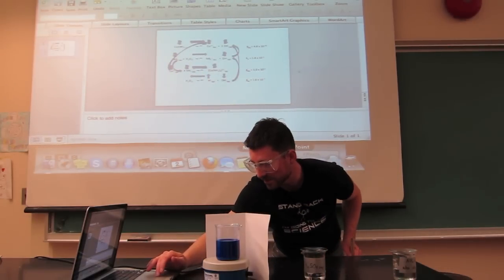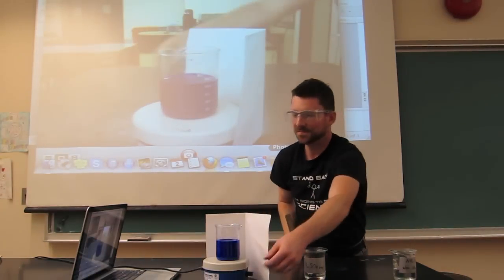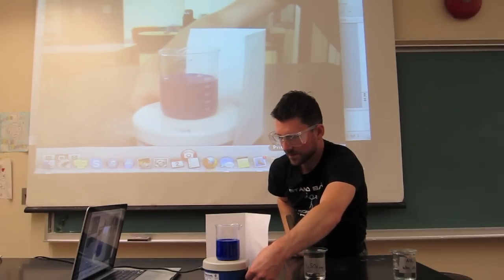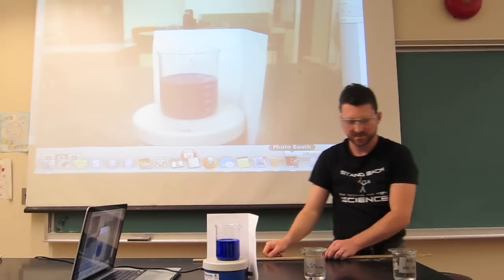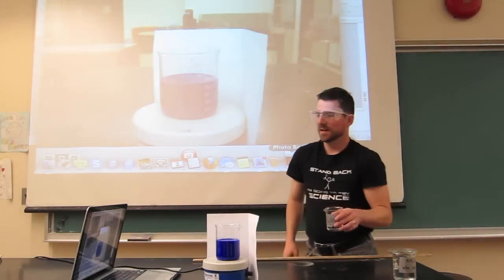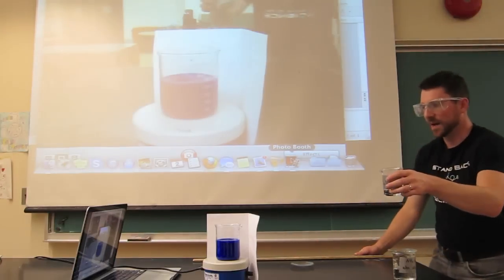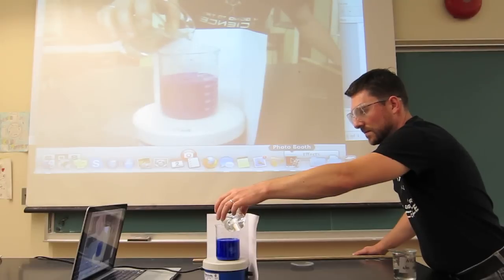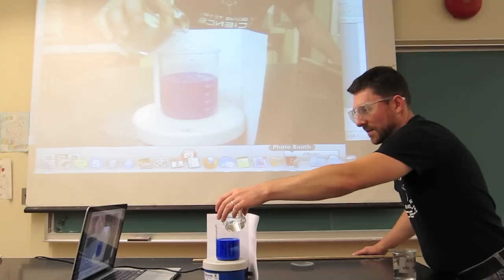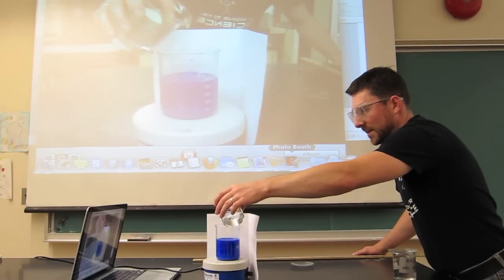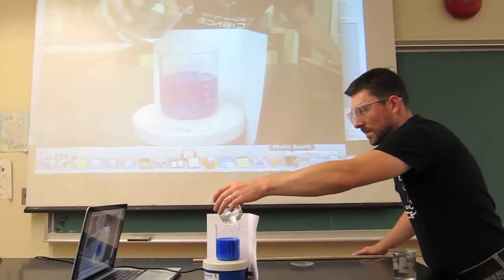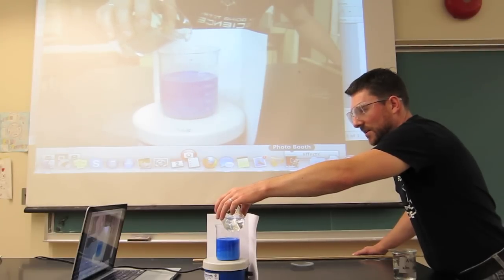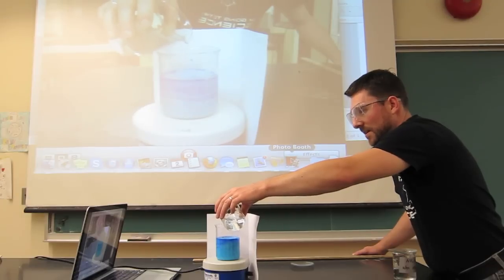So, let's see if our predictions are correct. Putting it back on the big screen. Turning the stirring back on. The first thing we should see is dark blue should disappear, the precipitate should return, and then the precipitate should disappear, giving us back our light blue copper 2+. Adding a little bit of acid. We're already starting to see some precipitate reform. And that dark blue color is starting to get lighter. There's our precipitate coming back. Dark blue is still going away. Dark blue is almost gone now, so our complex is almost completely disappeared. And our precipitate is back.